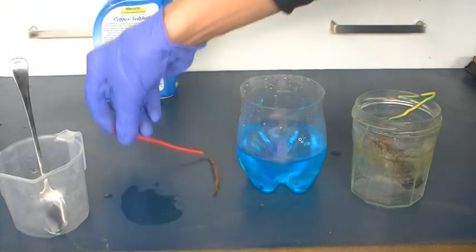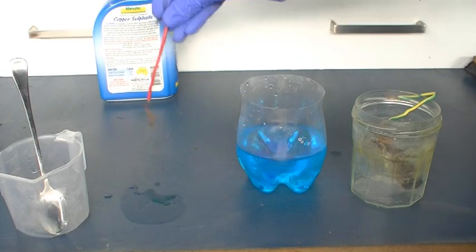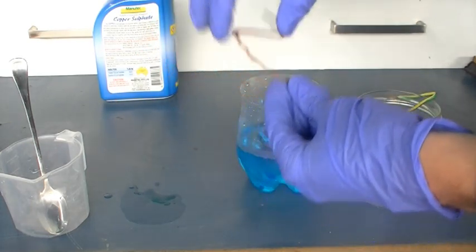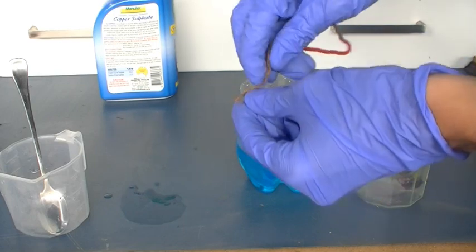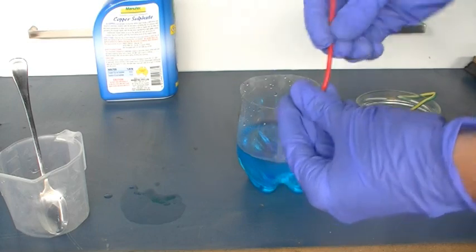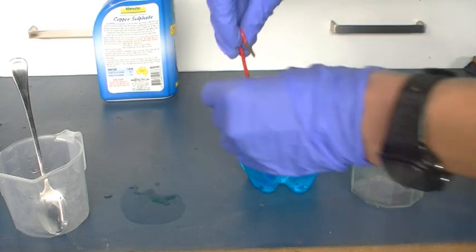Next thing you're going to need is your electrodes. Now for the cathode where you'll be reducing the copper ions into copper metal, obviously the best choice is going to be copper, seeing as it's copper metal already and it's inert to sulfuric acid that we'll be generating. Let's put that in.